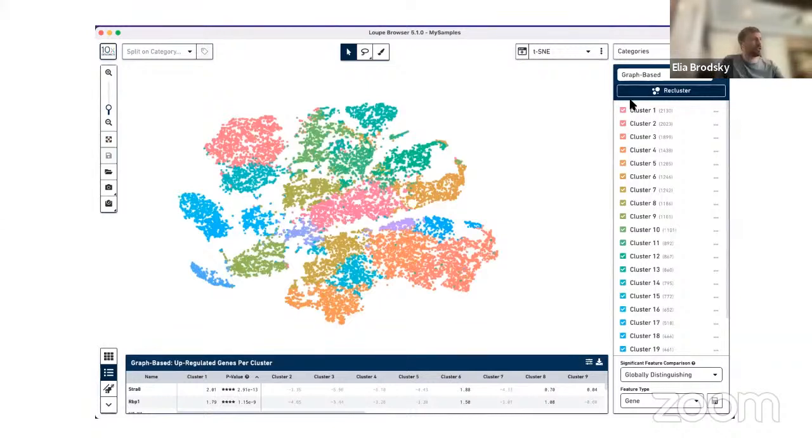And this is an example, a screenshot. You can see it's 10x Genomics. Essentially, the approach is going to be similar, right? Let's reduce the dimensionality and look at either all of your data or sample-specific data. Remember that in each sample, you have thousands of cells. And let's try to categorize them by clustering.